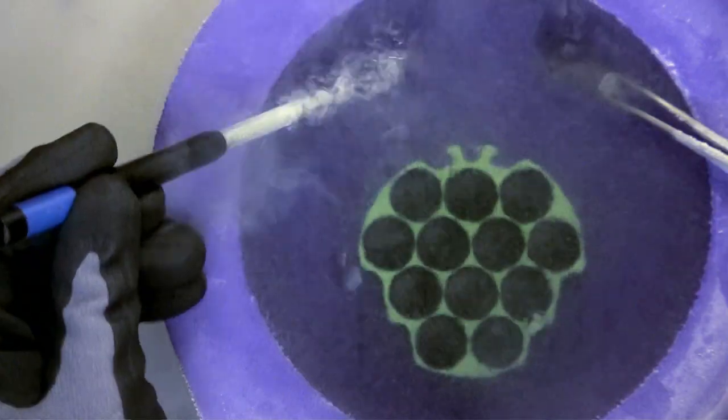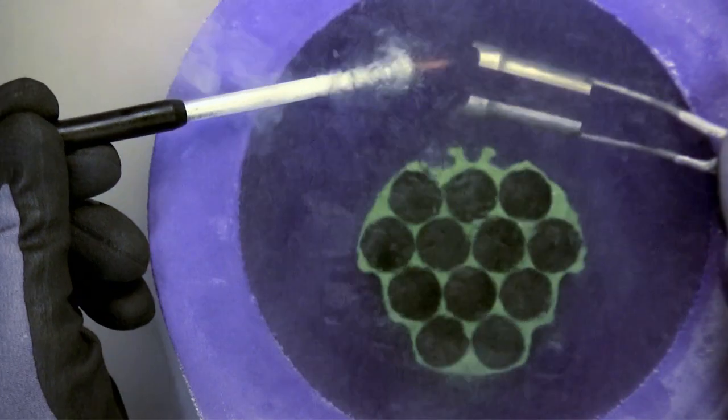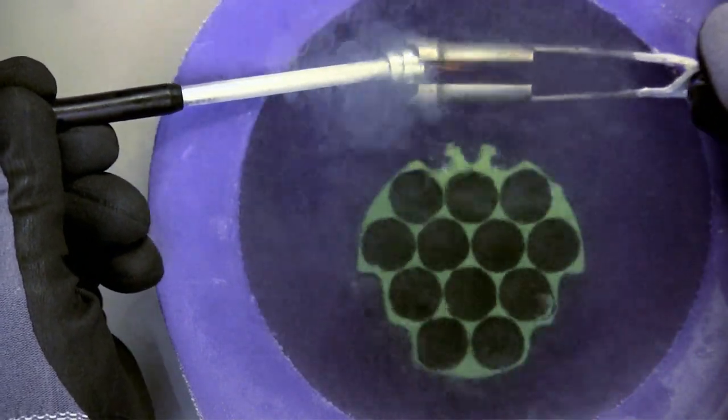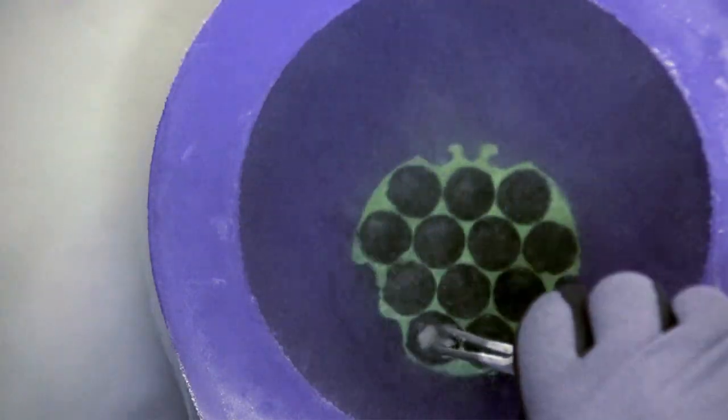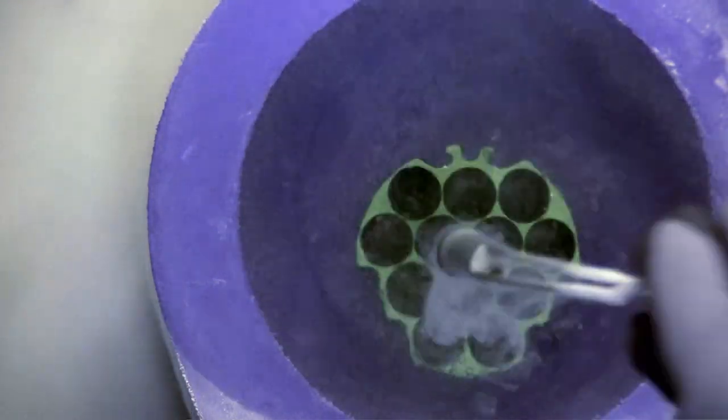After looping, plunge the sample into liquid nitrogen and then transfer to the tongs. Once the tongs are loaded, put the sample into the puck. The tongs are protecting the sample so there's no reason to rush this.